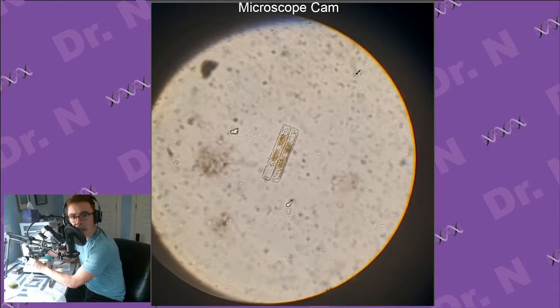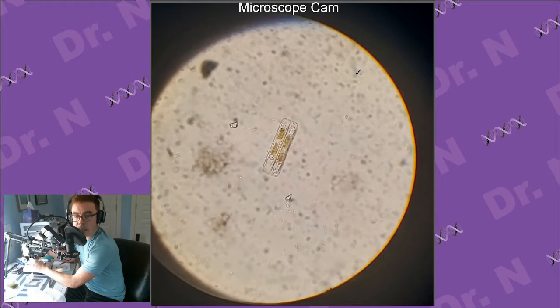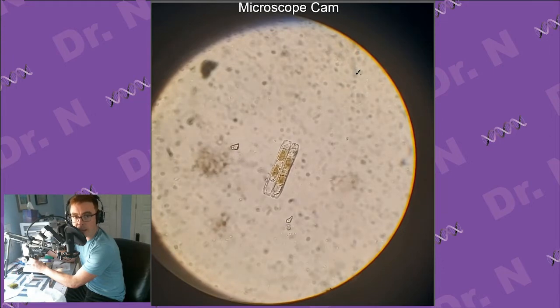That's cool. Yeah, I've found these guys before when I've done this. They also are pretty resistant to that blue staining. So what that could mean is that they are, in fact, maybe much closer to a eukaryotic plant where they have a cell wall protecting the outside of them. Because I don't think they're bacteria. That's cool. Little guy right there.